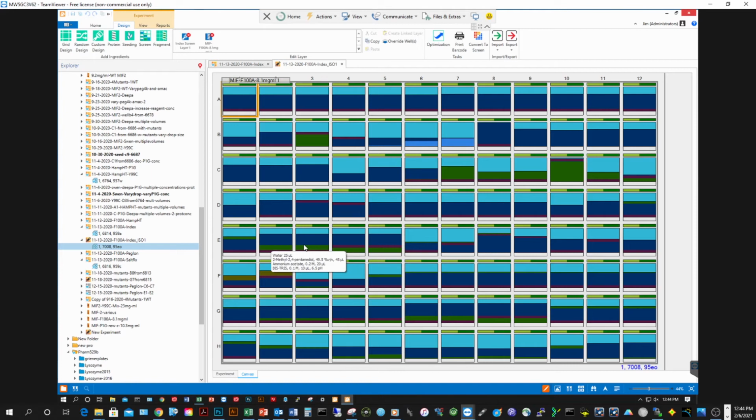So in theory, this is great, but we actually have to do the experiment in the lab. So several options are creating it yourself with the library reagents, either manually or preferably by using a microfluidic screen builder robot, such as the Formulator, also by Formulatrix, an instrument our core is considering as an investment, or an option more convenient and realistic currently is to take the screen, export it as an XML database file, and then we can send that to a commercial screen vendor and have it made, as they already have all the reagents and the screen building liquid handlers.